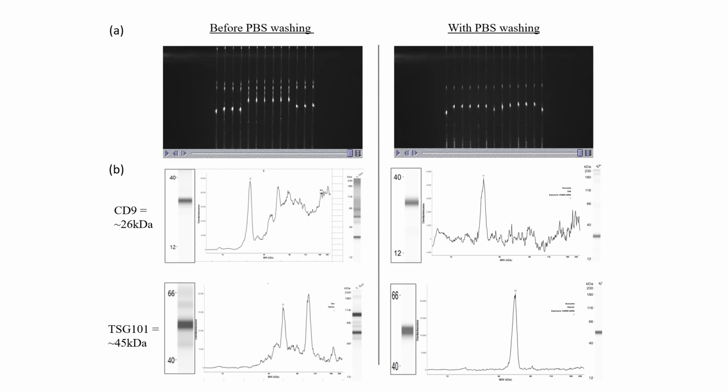Post-purification with PBS, the time taken for protein separation electrophoresis was also reduced, and the lysate in the capillary moved downward at the same pace as the other samples, eventually generating less hindering background and leaving the targeted signal peak distinguished. Compared to before the wash, there was outstanding background or jagged peaks, together with the targeted peak signal for CD9 and TSG101, indicating detection of possible contaminating protein expression.